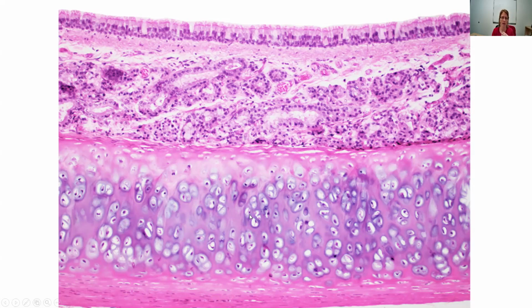So I can automatically rule out bone because I don't see anything that looks like an osteon in here. And since we're doing bones in class this week, you've seen the osteons, you've had some extra experience with those. I don't see anything that looks like circular rings that would be an osteon. So I know this has got to be cartilage. Now to determine which kind of cartilage it is, I got to think a little bit harder.